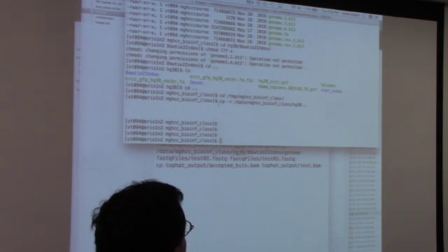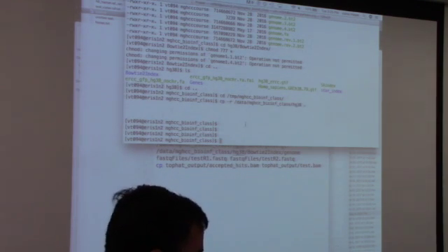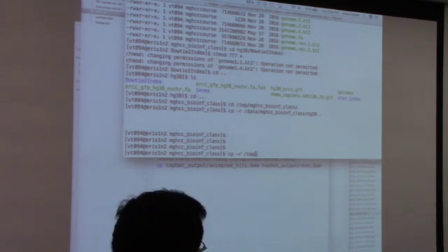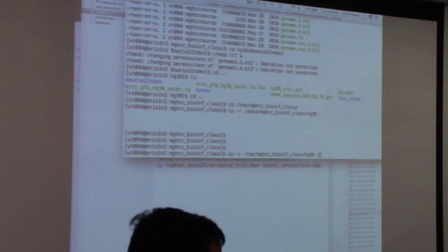Okay, so now in that time this has copied. Now please go ahead and type this command: cp -r /temp/mghcc bioinformatics blah blah blah /hg38 to dot, assuming you're in awesome, and then press enter. Okay?